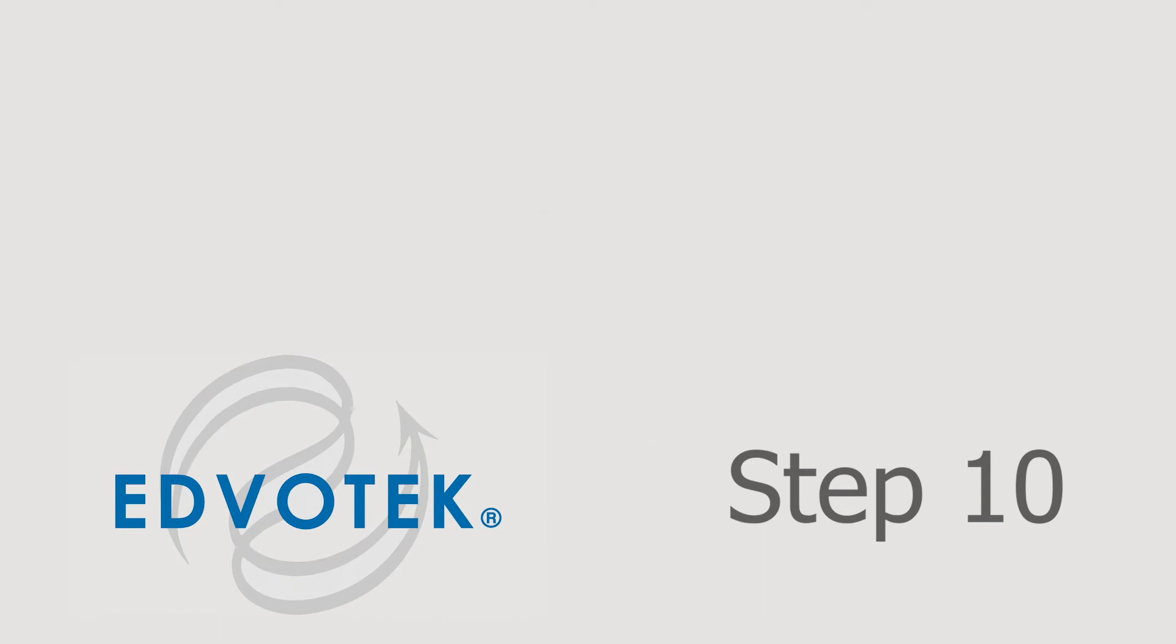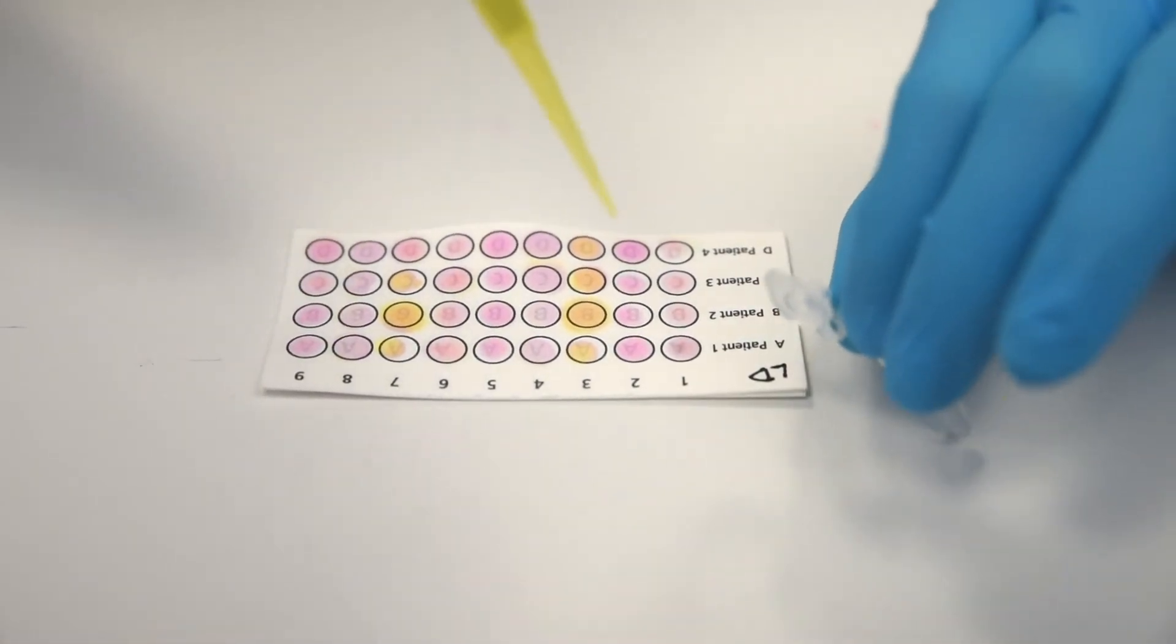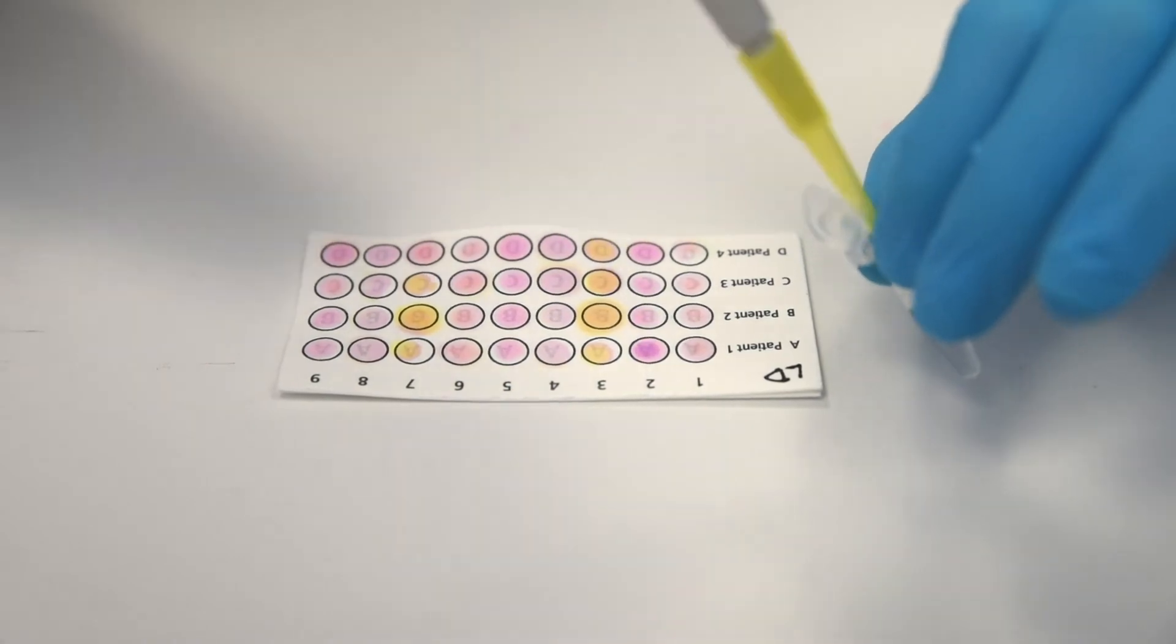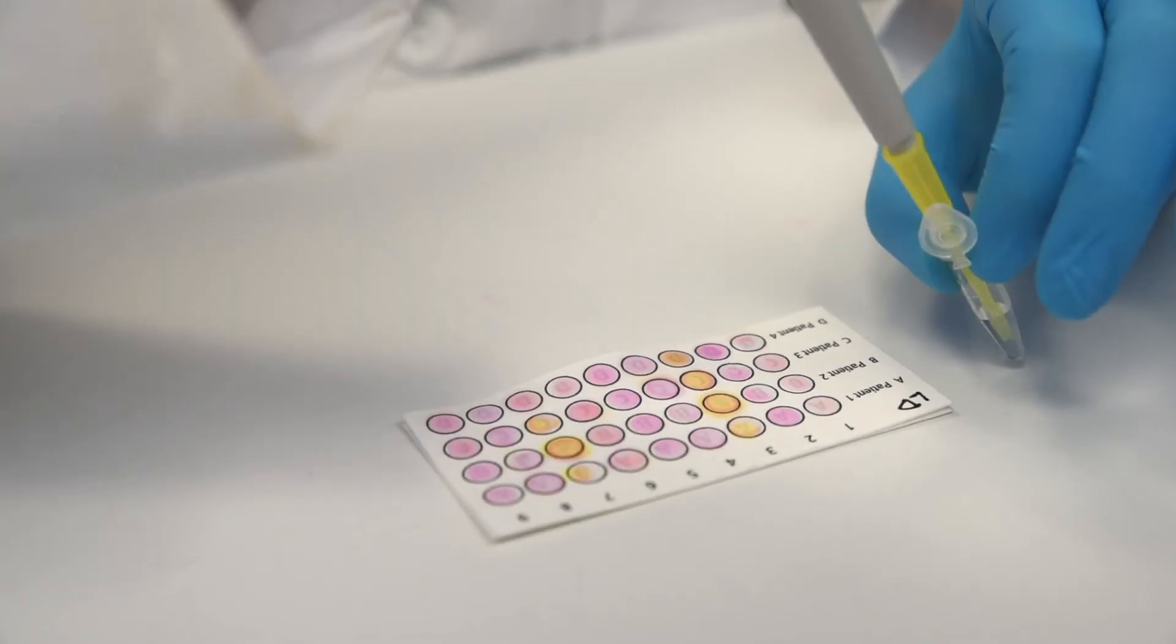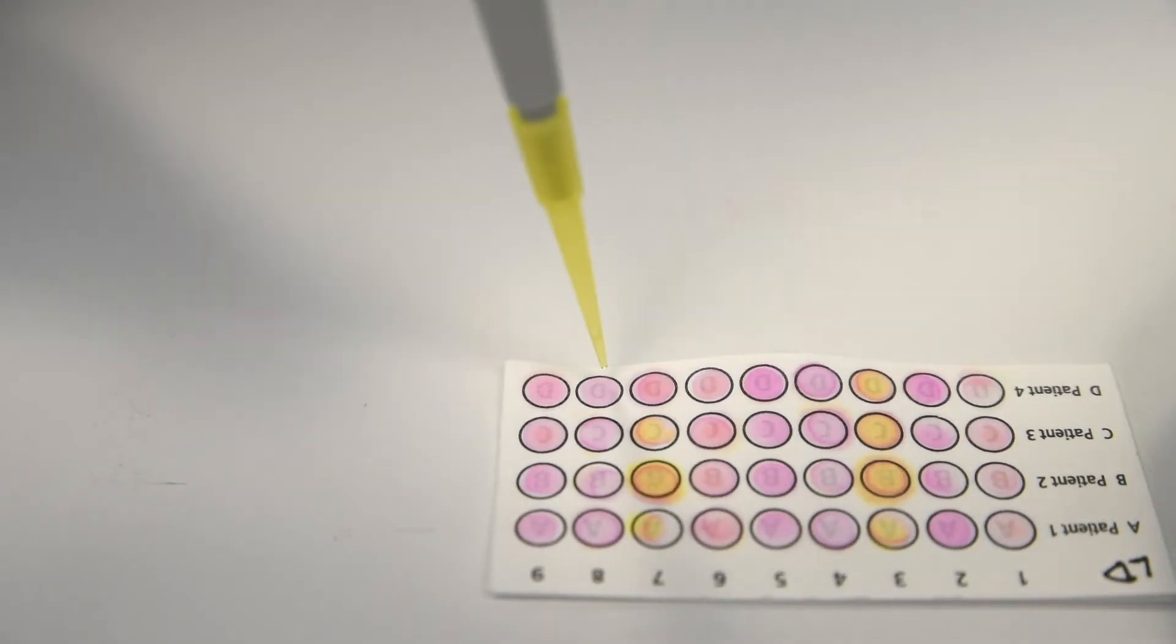Step 10. Apply 5 microliters of hybridization buffer (HB) to each spot on the microarray card. Once again, the same pipette tip can be used to apply buffer to each spot on the entire card.